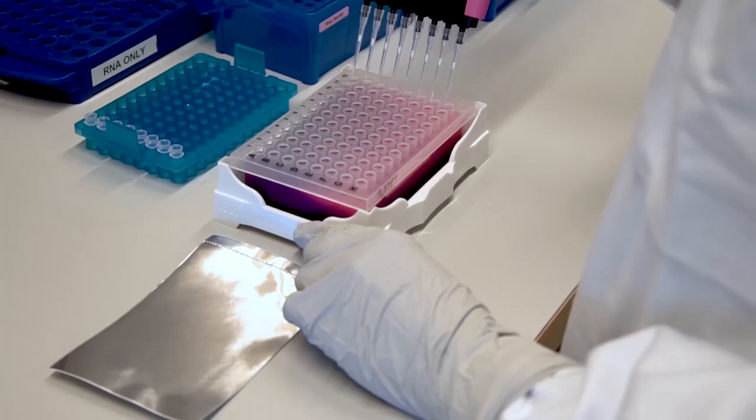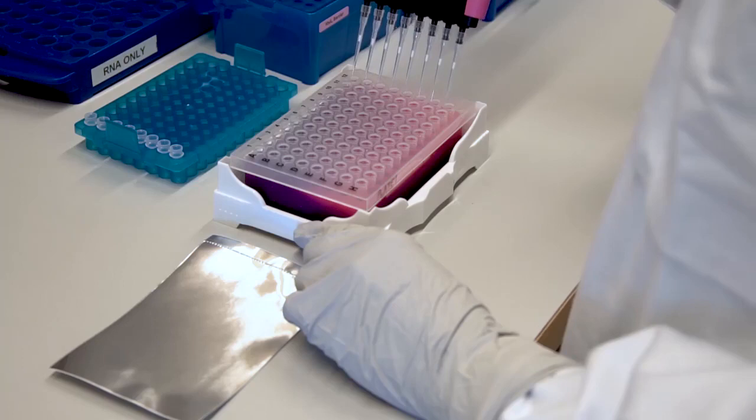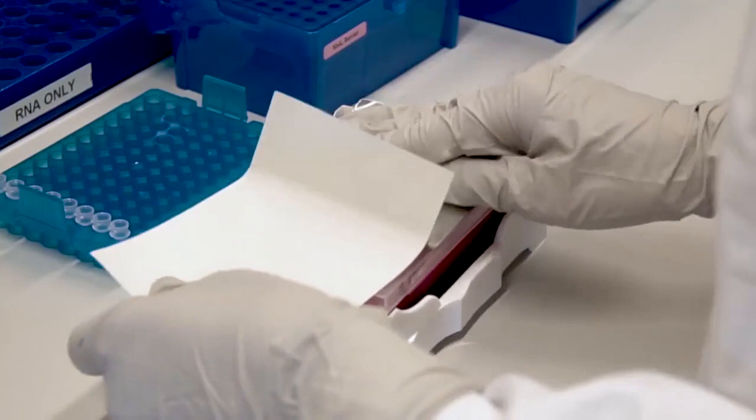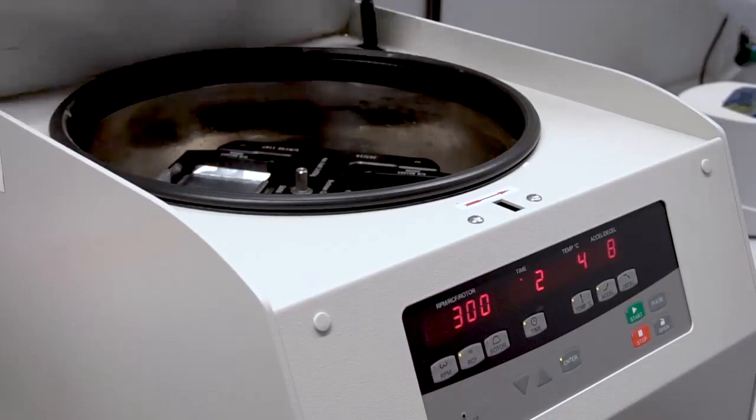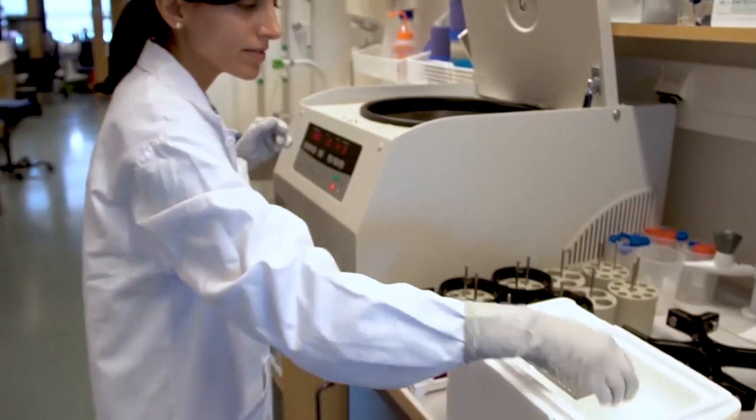Next, distribute 4 microliters of lysis buffer to each well of a 96-well PCR plate, and seal the plates with adhesive film. Spin down the plates to collect the liquid at the bottom. Keep the plates on ice until cell sorting for a maximum of 24 hours.